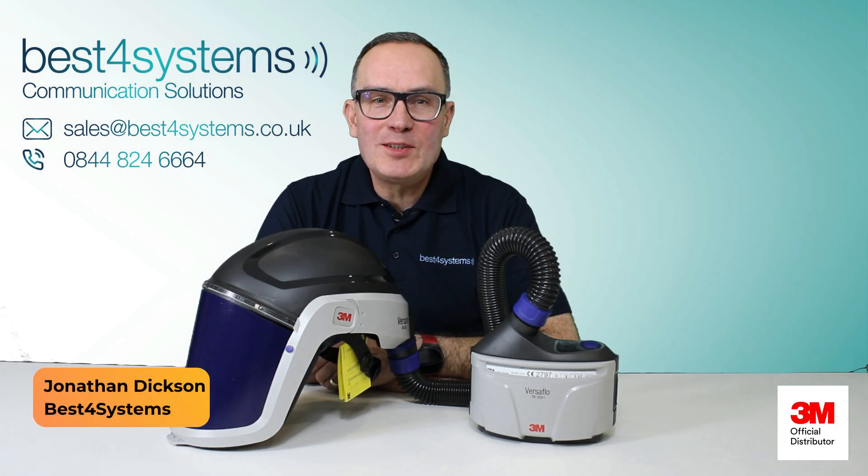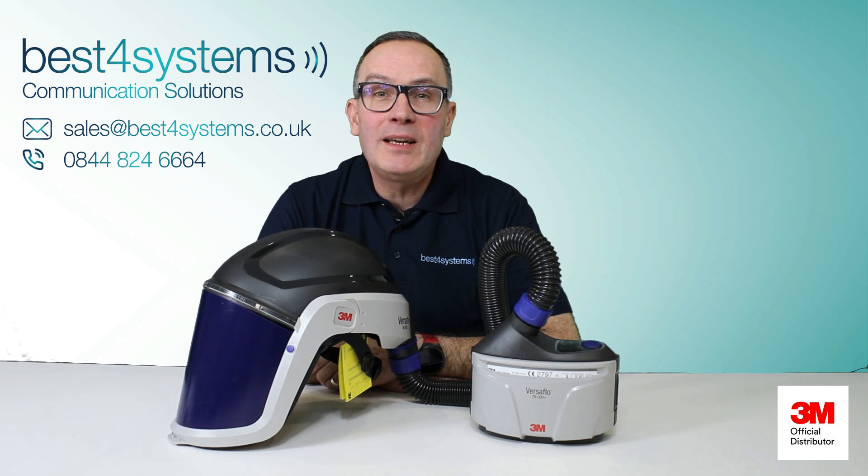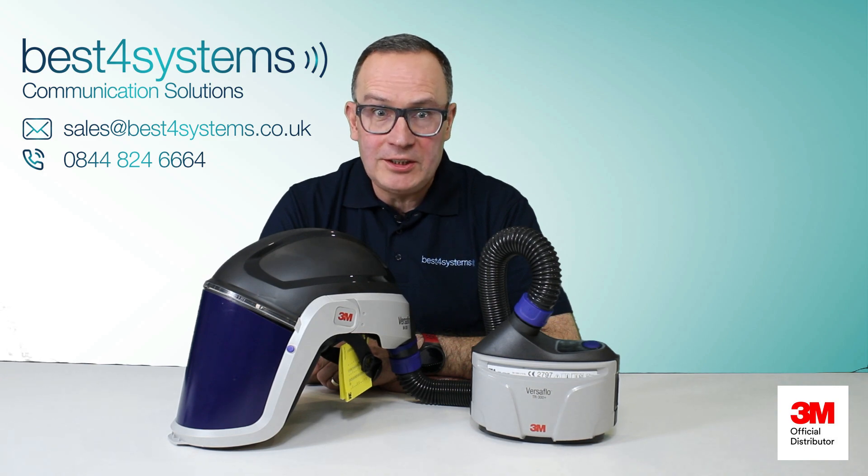Welcome to Best4Safety, Best4Systems Guide to Powered Air Solutions. I'm Jonathan, and today we're going to be going over the 3M Versaflo TR315 Portable Powered Air Solution. We'll run through its key attributes, available options for head tops, and discuss how it can protect you.